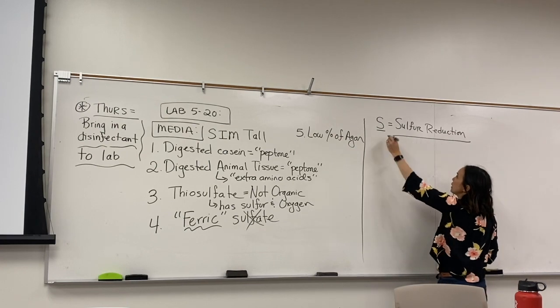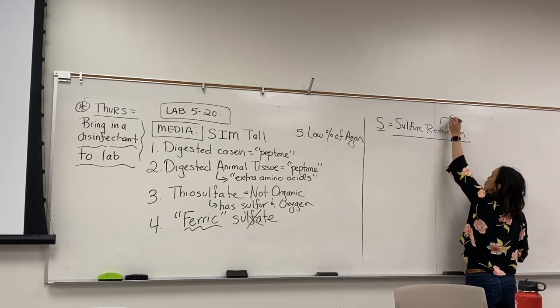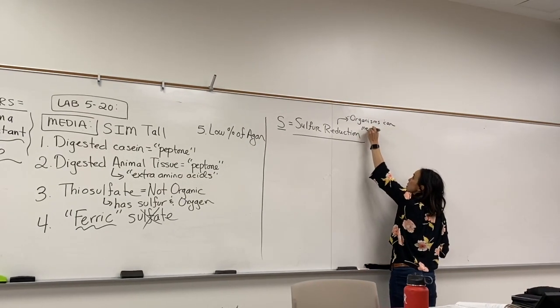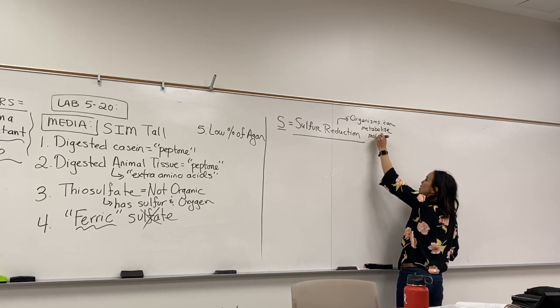Just to clarify what that means, on the sulfur reduction part, we're just going to see if your organisms can metabolize molecules with sulfur.